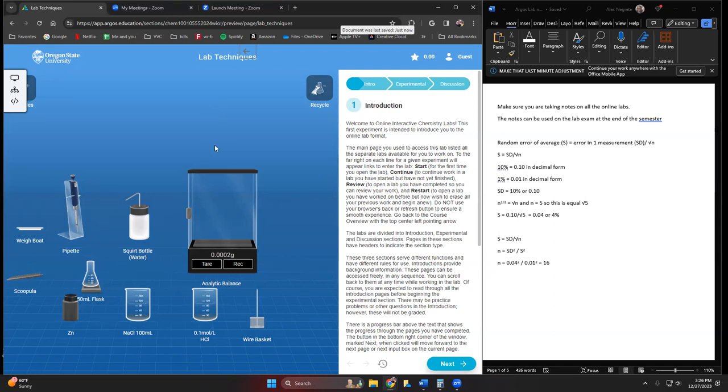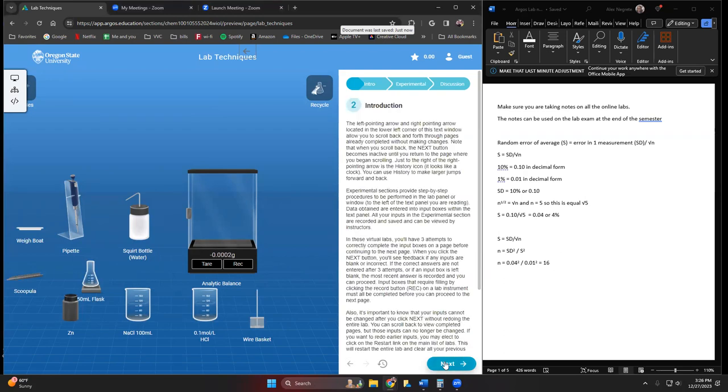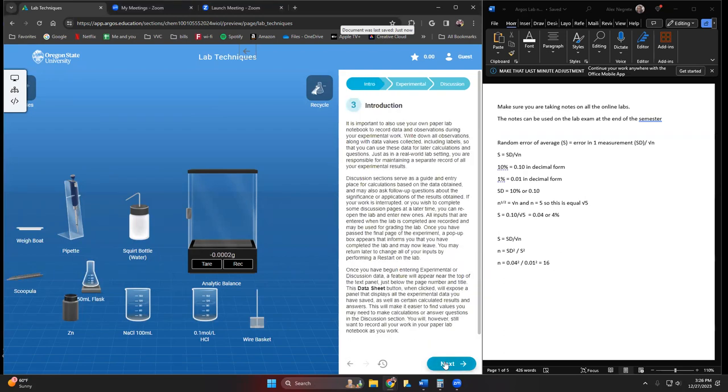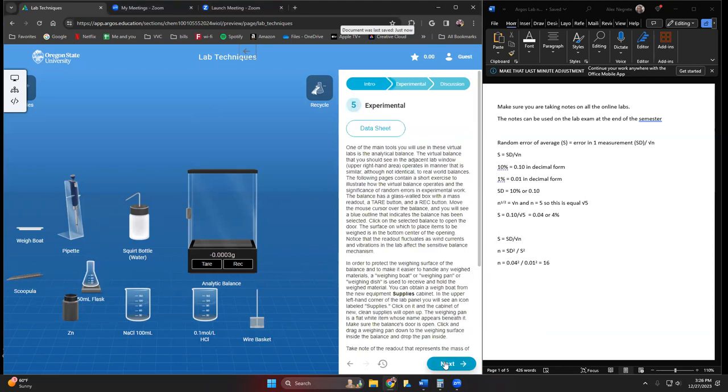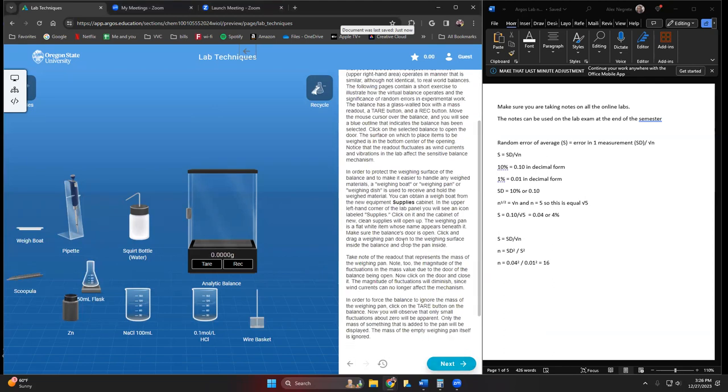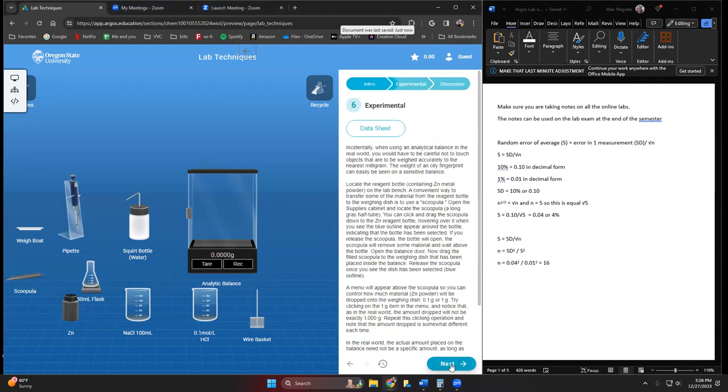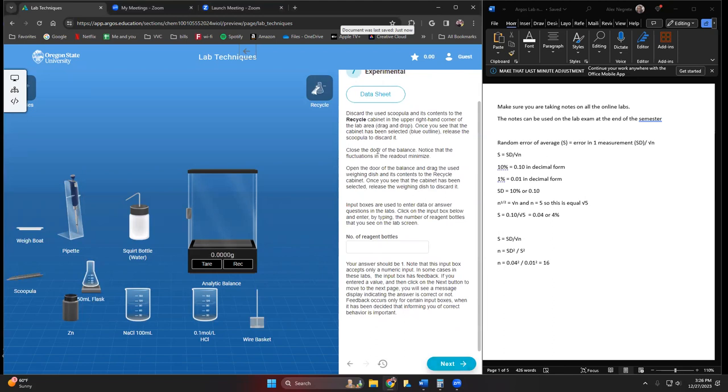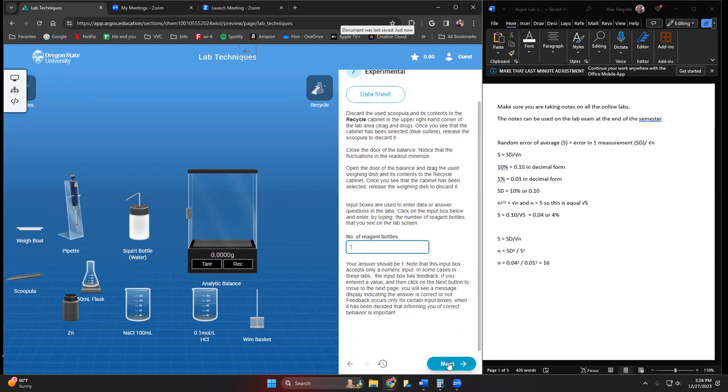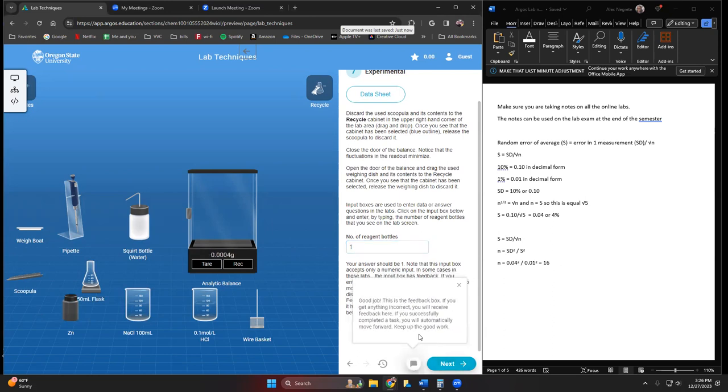I'm not going to go through every single page here, but I do want to point out some things when we're answering questions. Sometimes we're going to be manually putting in a number. For reagent bottles, I only see one bottle of zinc here, so I would just enter my answer here and then I get some feedback. If the answer was wrong, it would say try again.